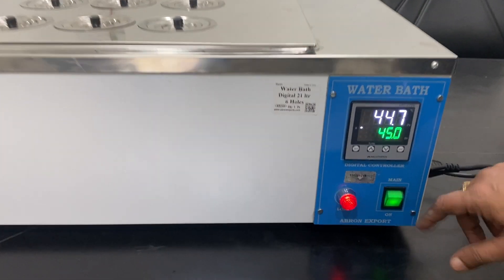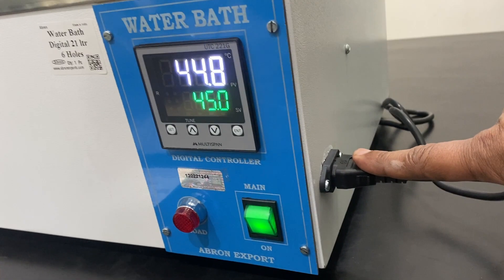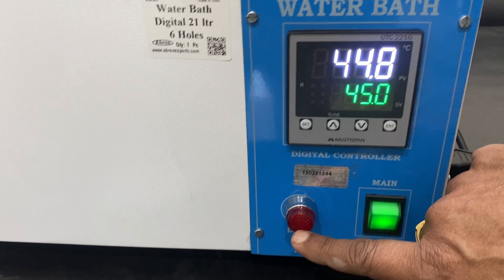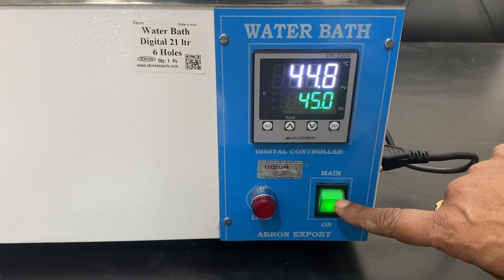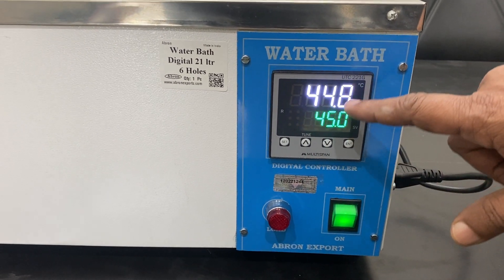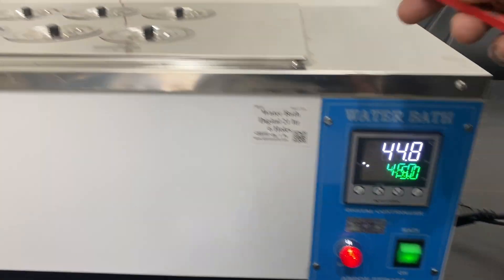This is the main switch, with the main wire connecting to 220 volt AC. This red indicator shows that heating is switched on. I'll show you the off switch when the temperature is close. Now heating is going on — let me show you inside.